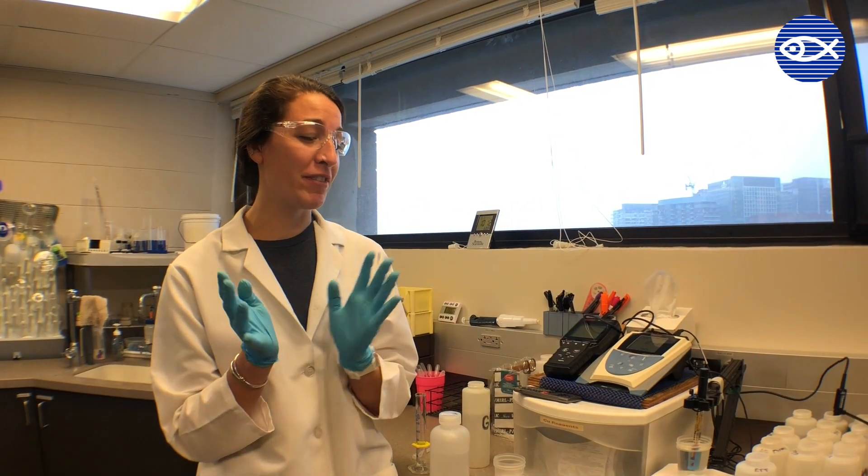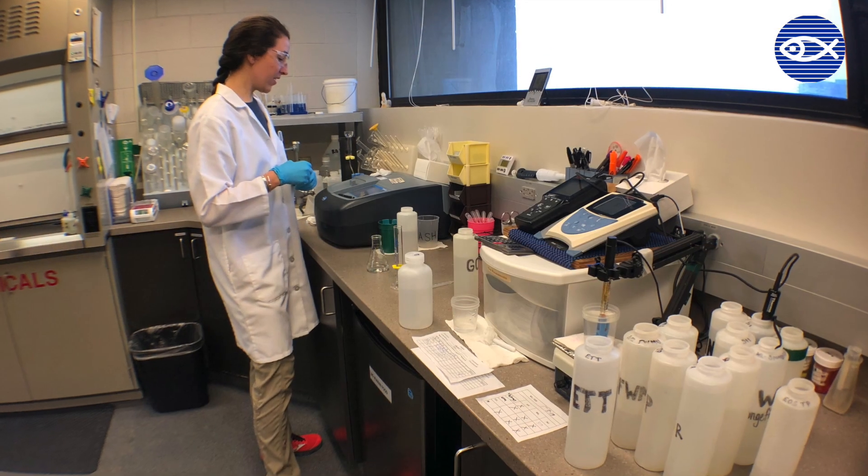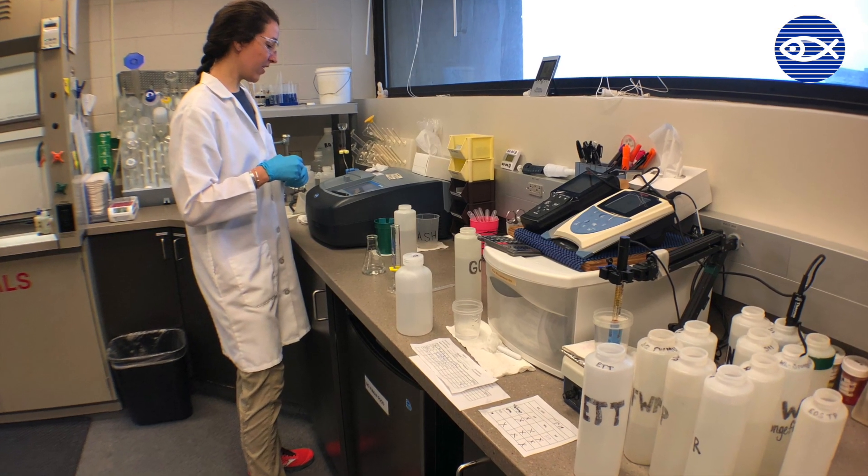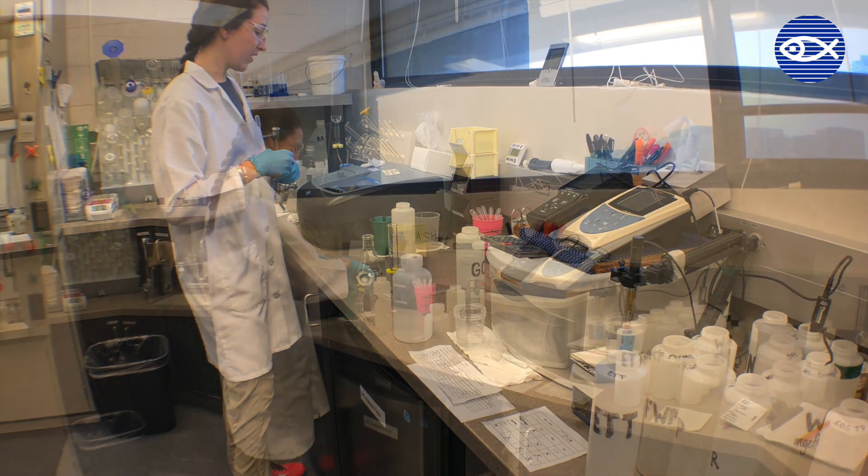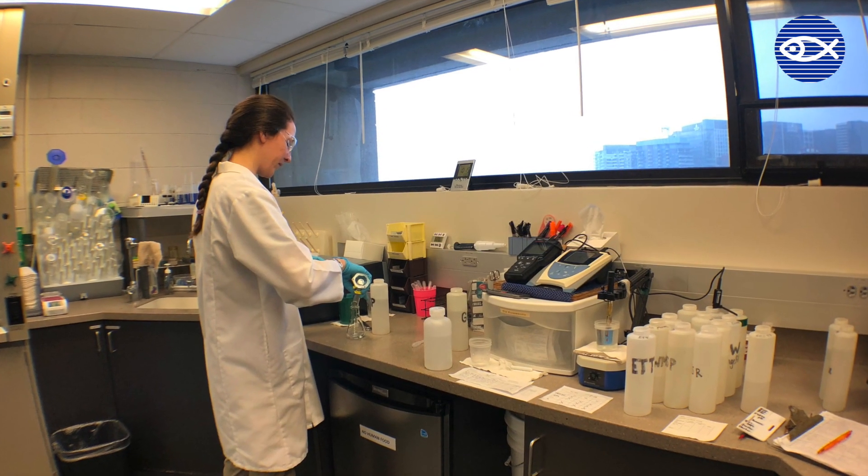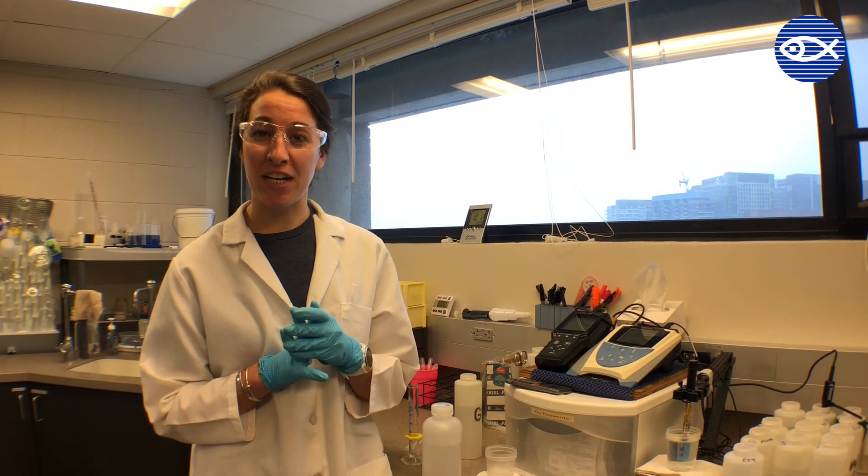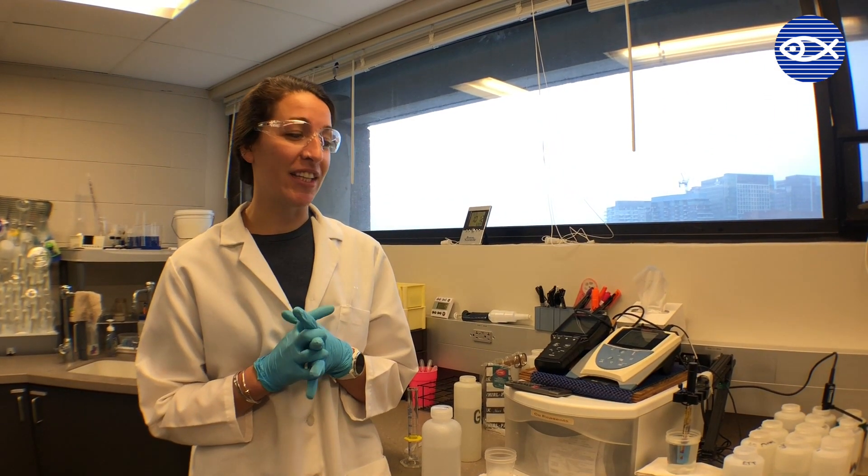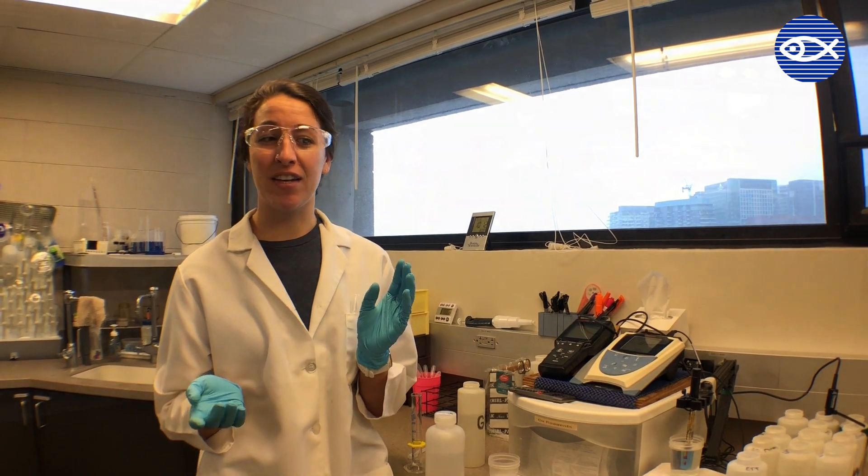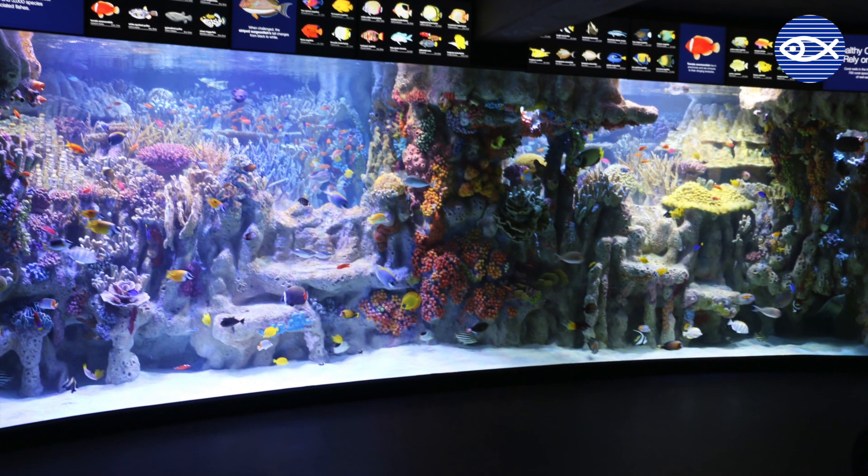We run a multitude of different tests. We usually do pH, salinity, and ammonia checks on every system at least once a week. Then we do all kinds of other things as well. We run nitrites, nitrates, and phosphates. We do alkalinity and calcium tests if the system has live coral in it.